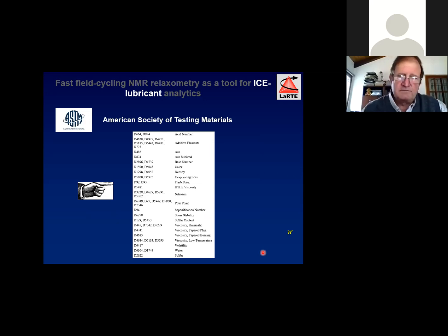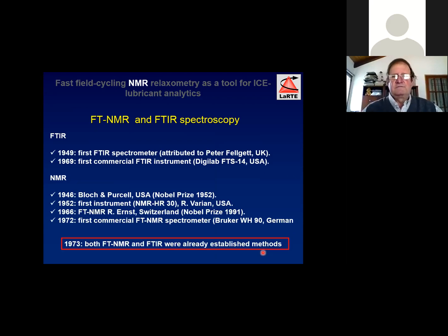Most of these techniques are physicochemical analyses, but I insist that the tribological performance tests of the lubricant are also very important analyses and are even normalized.